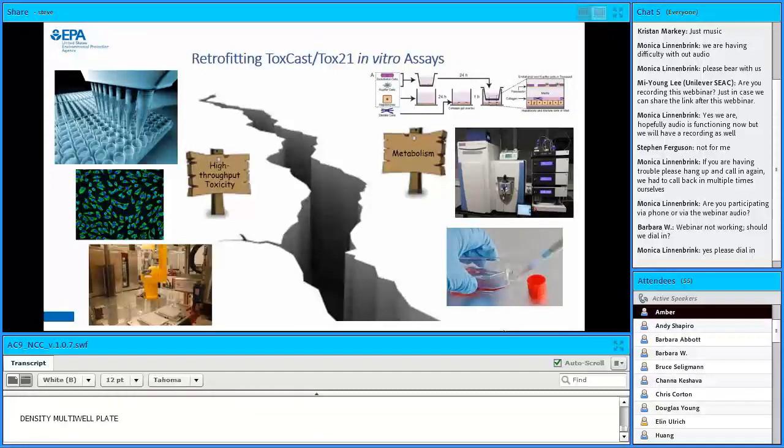We're using a lot of reporter genes, or analytes that are either fluorescent or luminescent, or change some property of light that we easily measure in a plate reader format. Through our partnership with Tox21, we've introduced robotics into the system. So we're pushing really fast, usually 10,000 to maybe even over 100,000 wells per day, and that's our focus in terms of high-throughput toxicity testing.